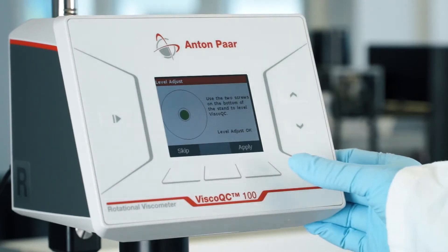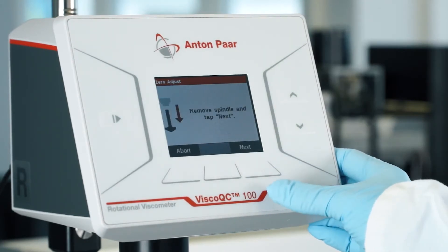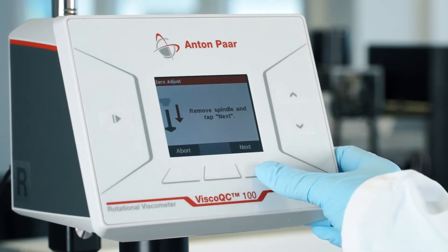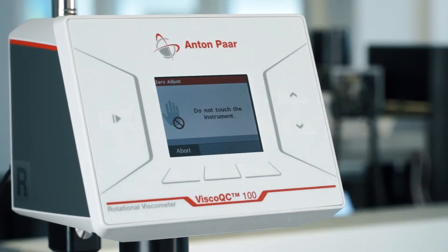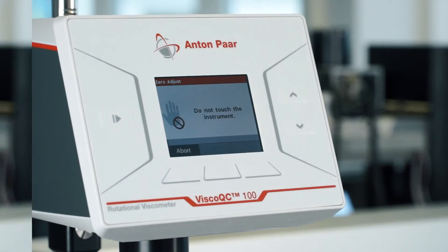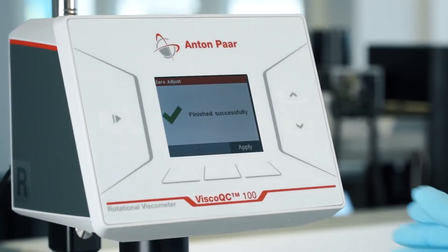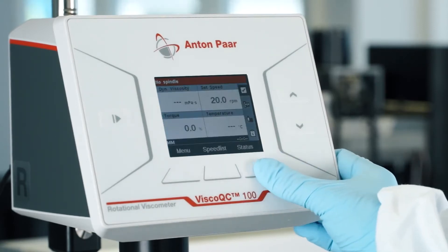Tap Apply. Make sure that no spindle is attached and tap Next. The instrument will now perform the zero adjustment. After it finishes successfully, Visco QC100 is ready for your measurement.